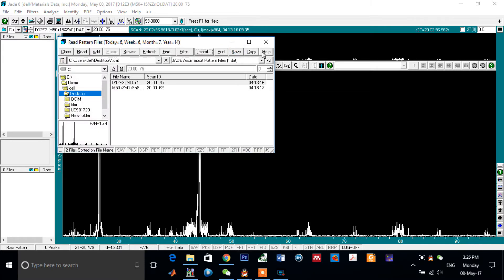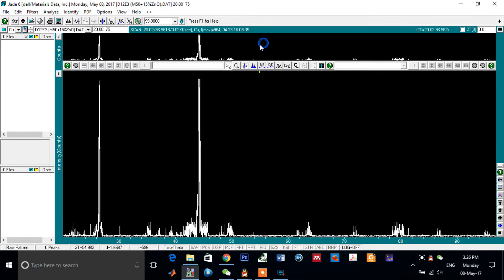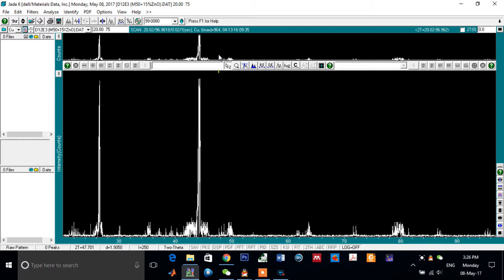Now the program is able to read our data file as obtained from the XRD machine. Next step, let's make some analysis on one of my samples.